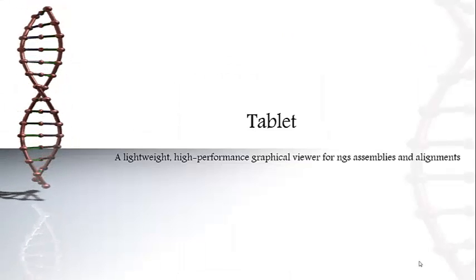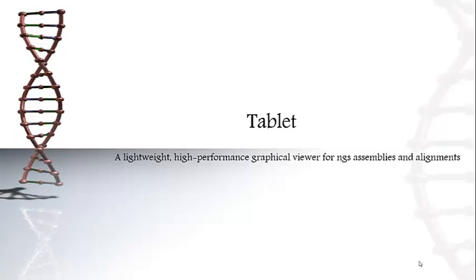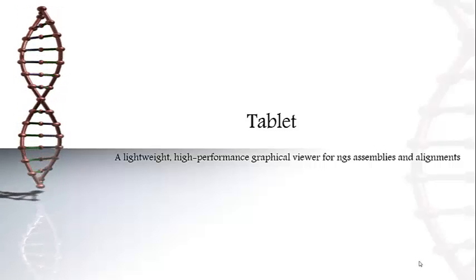Tablet is the last tool we are going to look at. Tablet provides a high performance graphical view of assemblies and alignments.